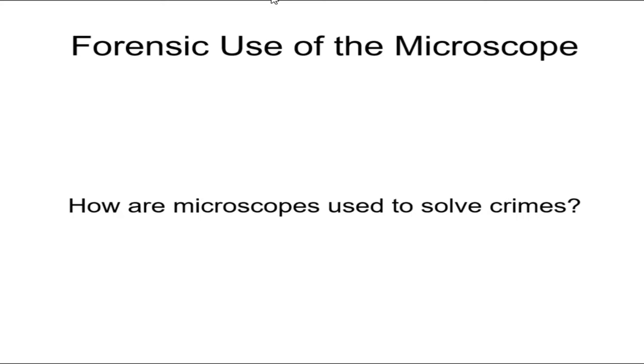One of the major tools of a forensics laboratory when they investigate evidence in crimes is a microscope. And here we're going to learn a little bit more about what that is and how it's used.